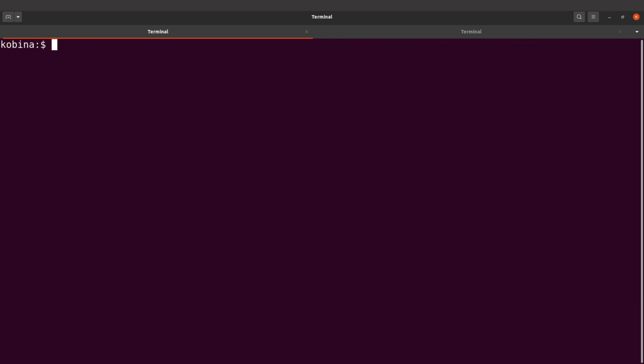Okay, so let's do this. Now we have built a database, but we still need to check something here. Let's just look at it. Let's do an ls into the database. So it's ls SNPEFF/data/AGY99.